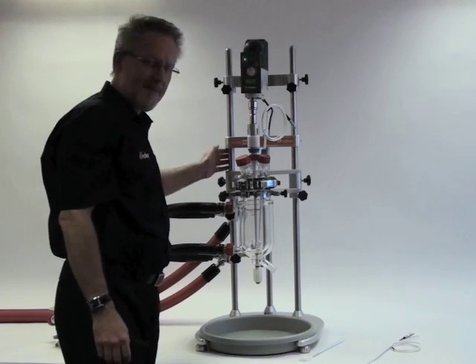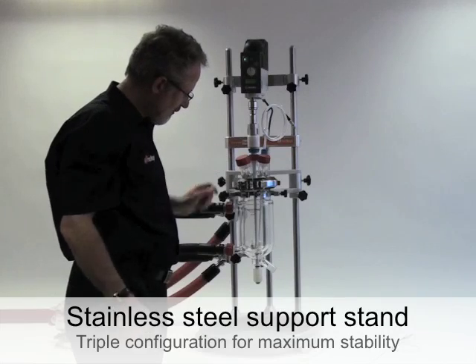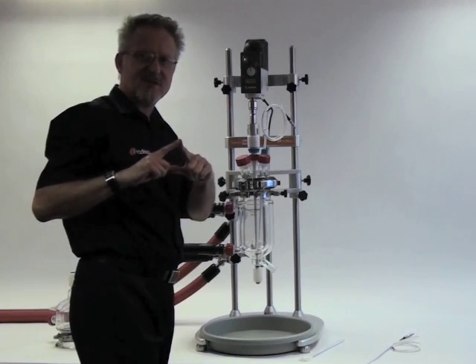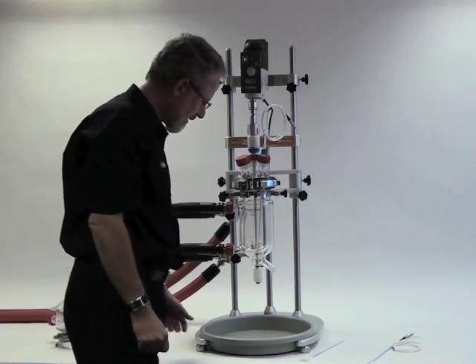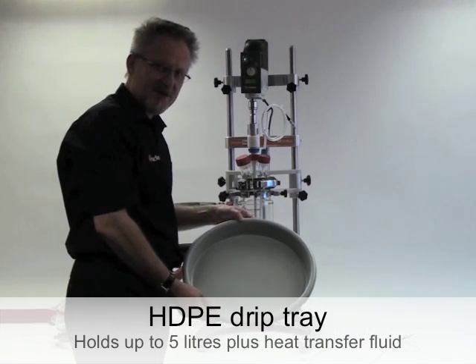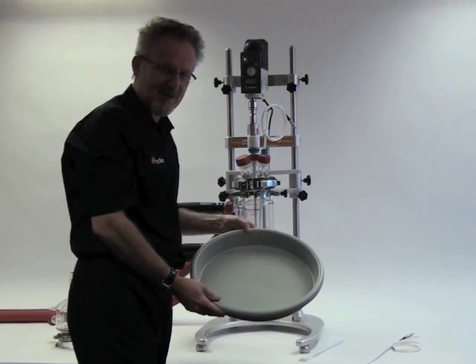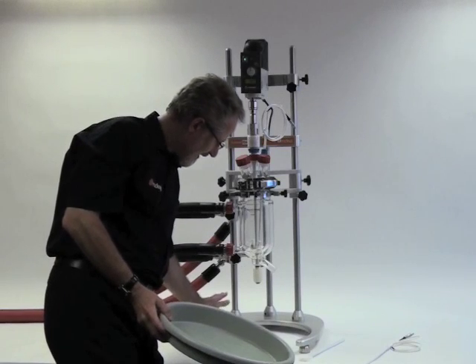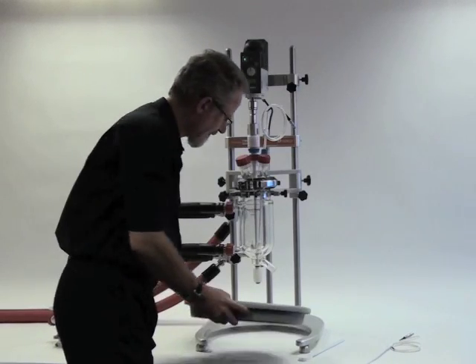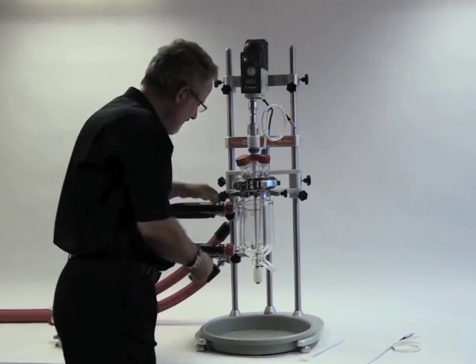The frame has three very large stainless steel rods arranged in a triangular shape to give a very sturdy support. The frame has a drip tray bund made from HDPE, which is designed to contain the contents of a 5 litre vessel plus the heat transfer fluid — a very heavy duty base with levelling feet. Everything on the frame is repositionable.